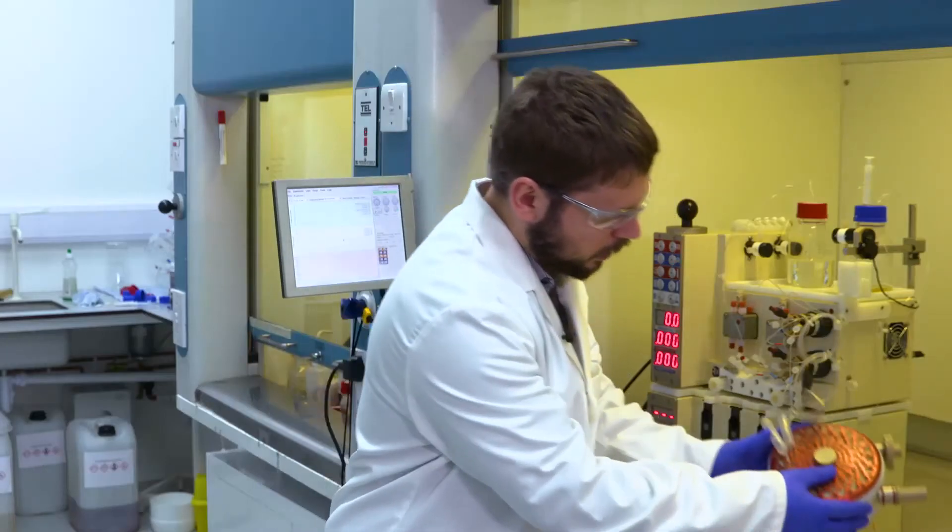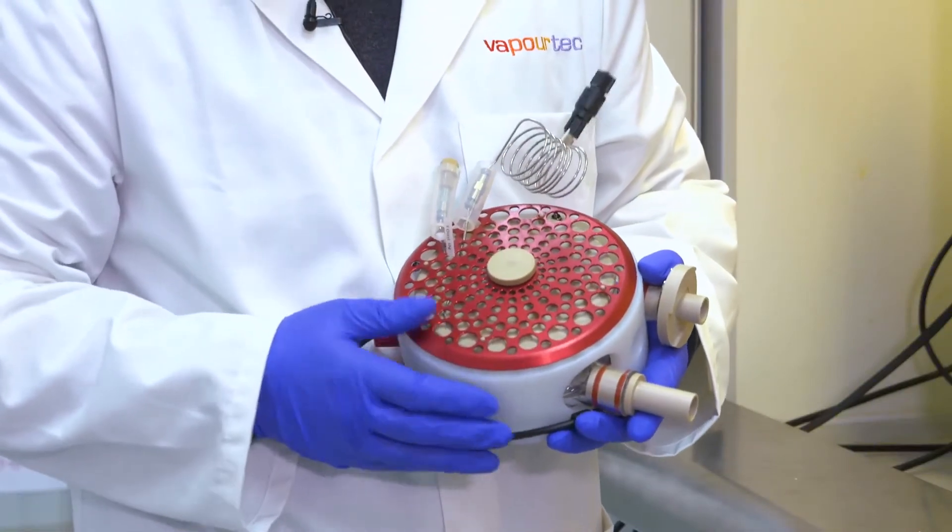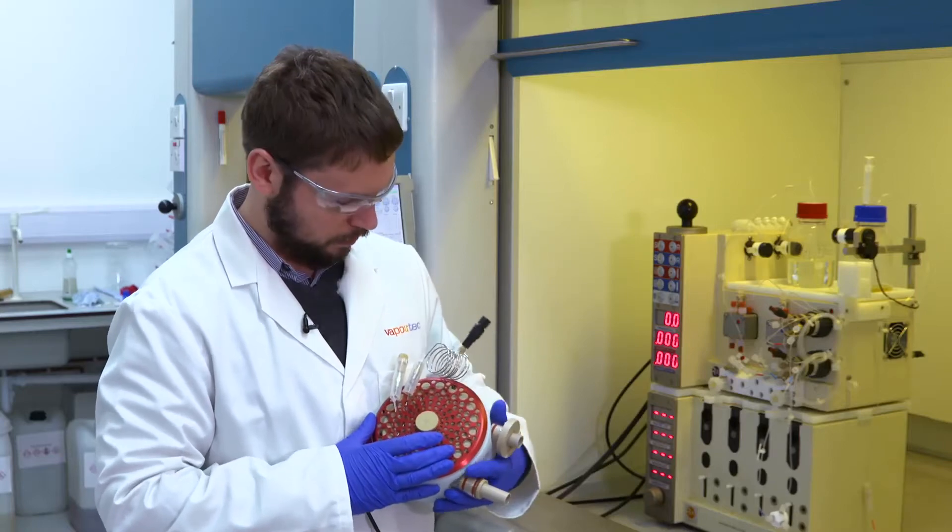The high-temperature reactor is available in Hastelloy and stainless steel. This is a stainless steel version and it has a variety of features that are important for its operation.